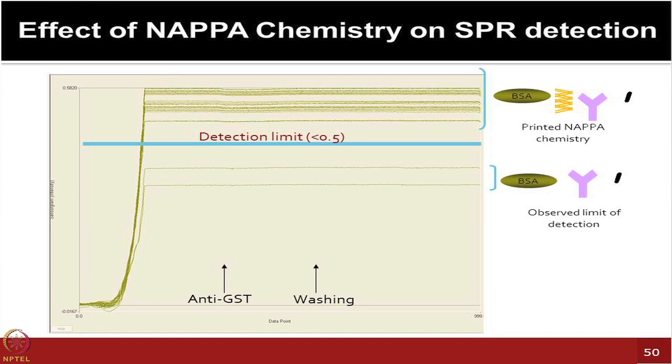This is the SPR imaging platform. I talked to you briefly about the technology, which is SPR imaging. You have been exposed to NAPPA arrays. Think about combining the two to harness both the power.